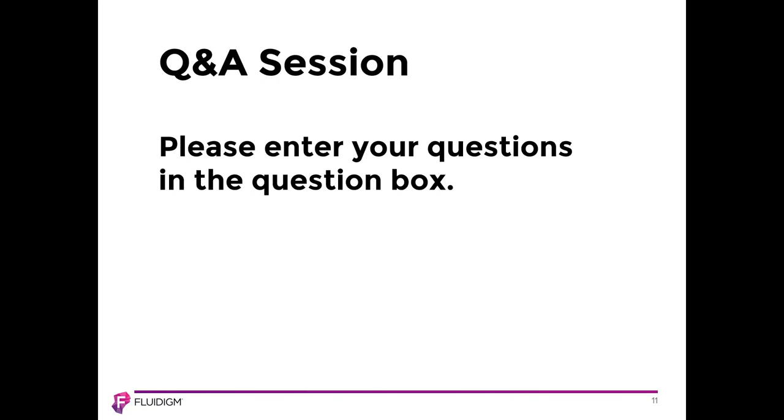Okay, we have another question for Andy for Helios. Are there alternatives to live cell barcoding besides using CD45? Yeah, good question. Absolutely.